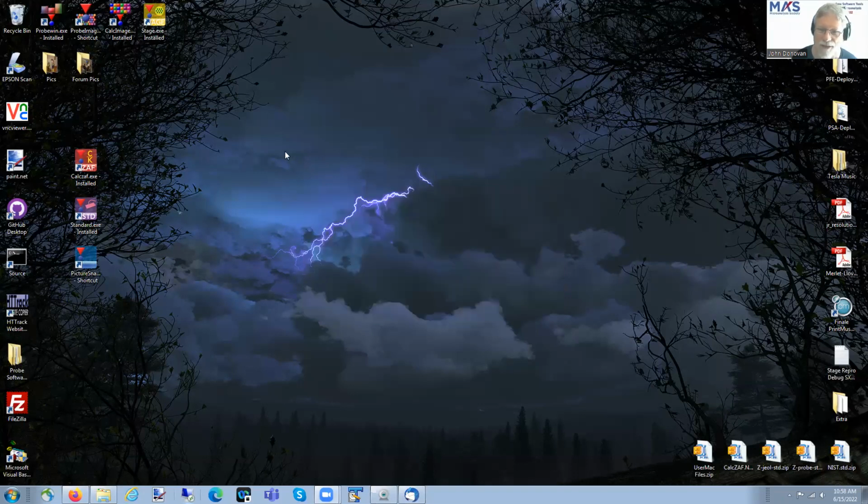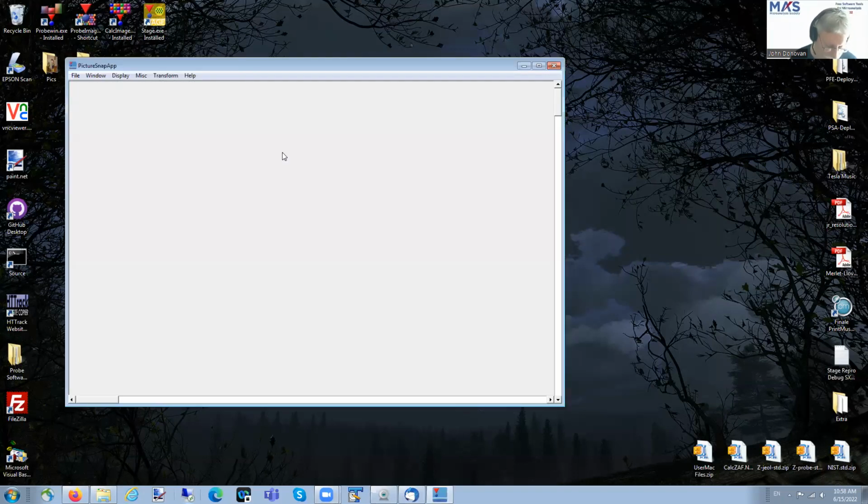The software is designed to deal not just with the problem of annotating or documenting your fields of view or points of interest on a single instrument, but more importantly, it allows you to take your annotations and points of interest from one instrument to another instrument, and another. Even if those instruments have different stage coordinates, different orientations, and different capabilities, it's kind of surprising.